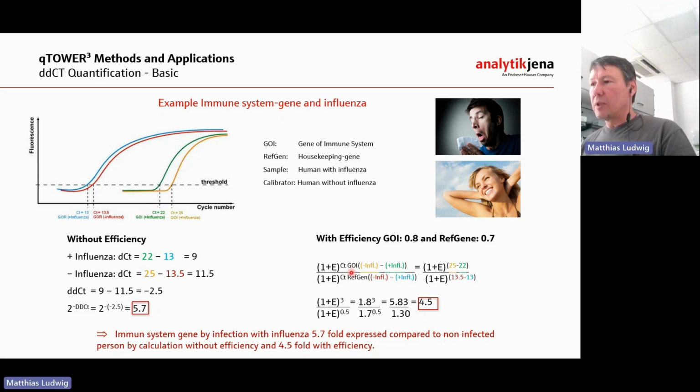And when we work with efficiency, we have additional values. We get a more accurate expression factor, and this is 4.5.